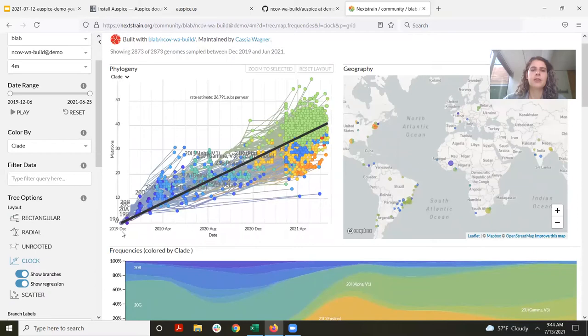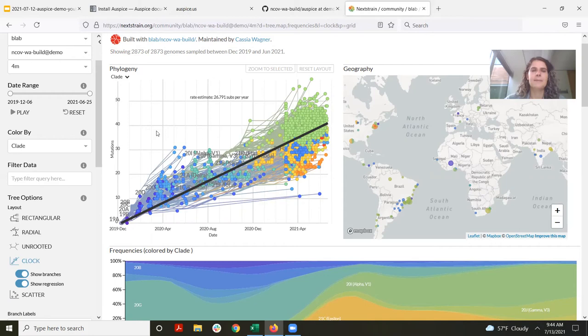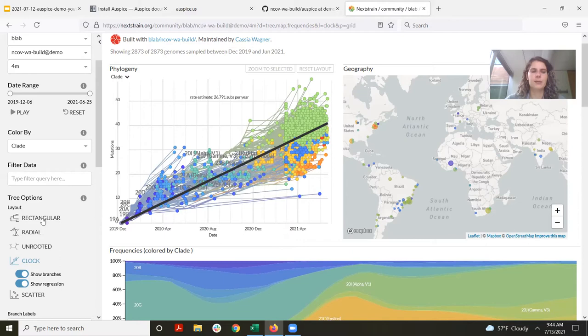In clock view, we show time on the x-axis and mutations or divergence on the y-axis. This allows us to estimate a substitution rate for the virus pretty readily, and it also helps us see samples that might be signs of sequencing error. For example, we have this cluster of samples that look like they have more mutations than would be expected from that time point — to me that's a signal that this might be sequencing error, and I would know to exclude these samples from any future analyses. That's clock view — we'll go back to rectangular view.